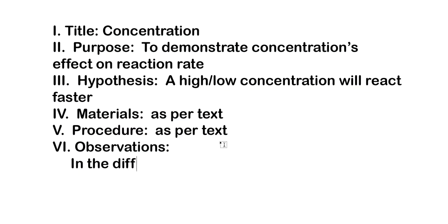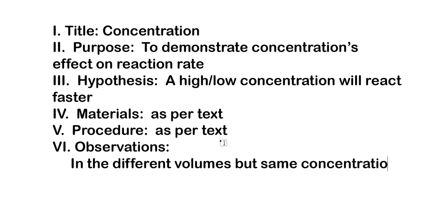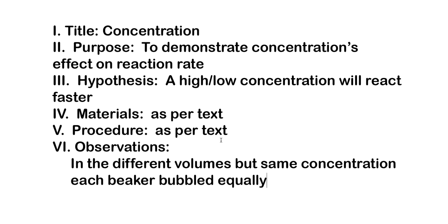In the different volumes, but same concentration, each beaker bubbled equally. Okay, that's our first observation.